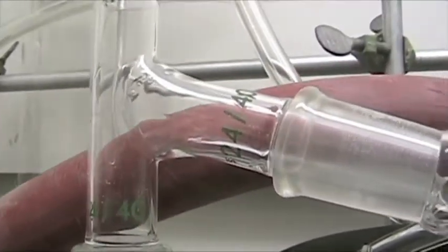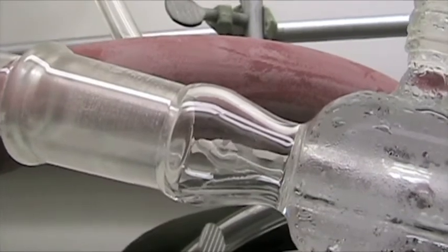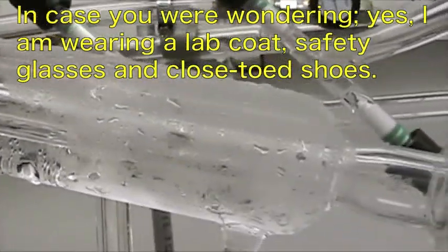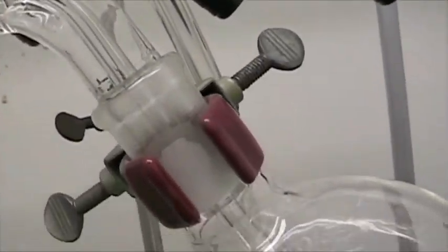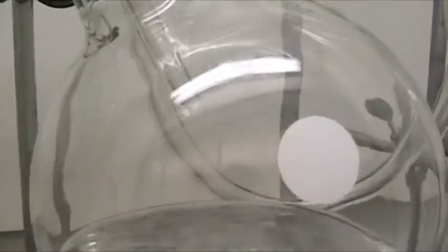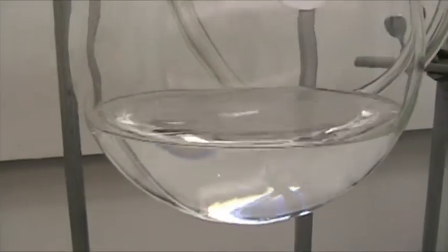It's a way of increasing the purity of the gas that comes up to the top of the still here into the still head, so the liquid's dripping back down. But some of the gas makes it up here — as you can see, it's condensing there and goes into the still head and over into the condenser. If you look hard, you might be able to see the gas kind of flutters along the side of the glass, then condenses and goes into this condenser where it's cooled and turns back into a liquid. It comes and drips right here and goes into the collection flask. It's being distilled under nitrogen because the triethylamine will oxidize in the air, which is actually what I'm removing — oxidation products for purity.